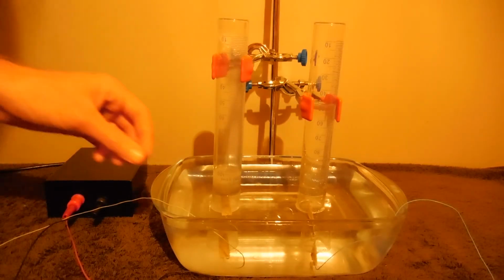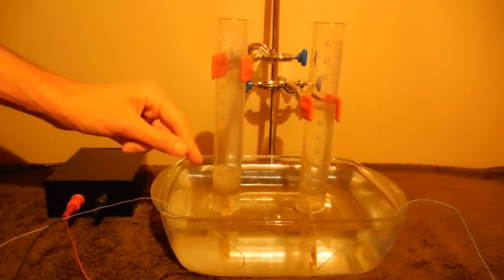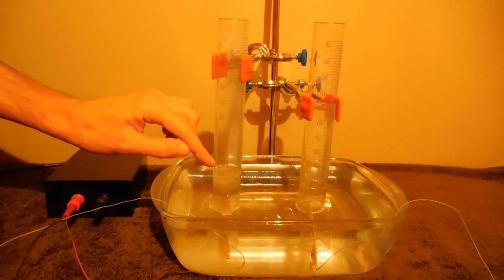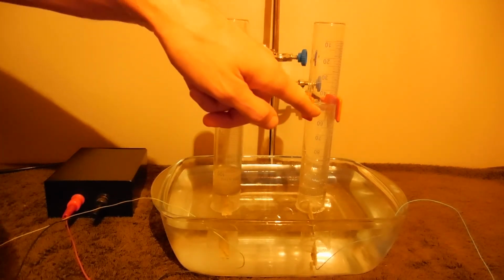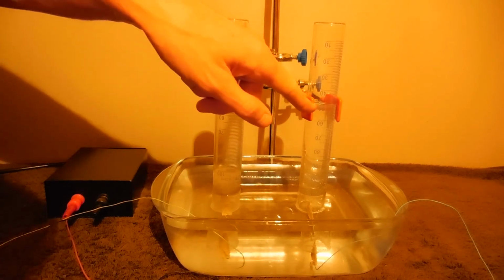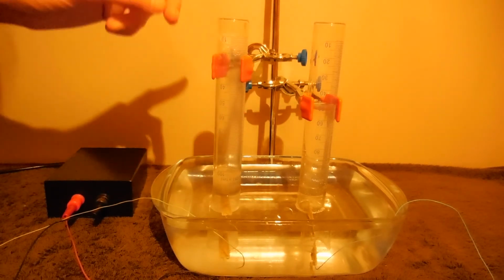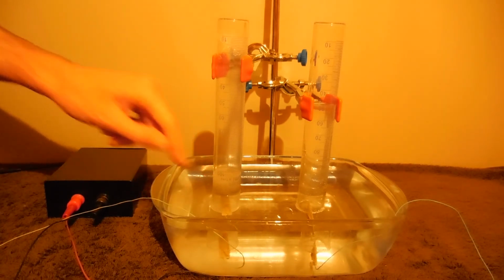After nearly 2 hours and 30 minutes, we can see volume of hydrogen is 100 milliliters, and volume of oxygen is 50 milliliters. 2-to-1 ratio between them. But let's see whether we have hydrogen here.